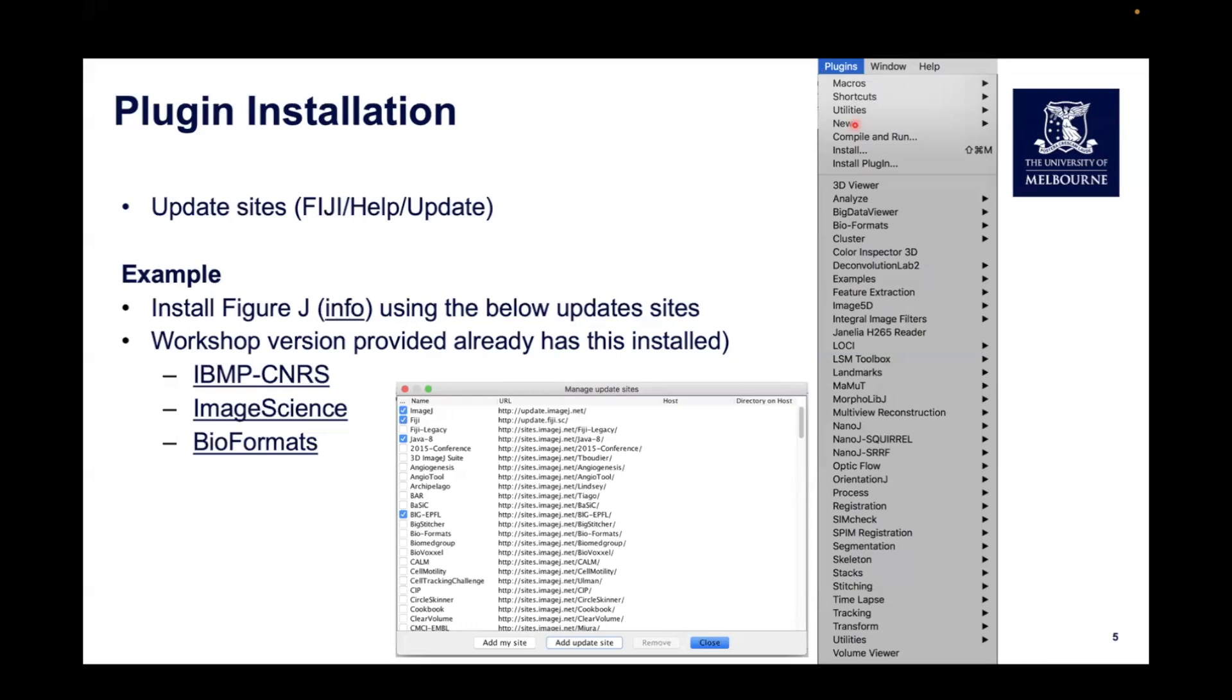The next thing we'll cover is how to install the plugin. To do this, we need to go to the Update Sites in Fiji under Fiji Help Update. The example we'll show here is how to install the Figure J plugin, which we'll be using later on in the workshop.